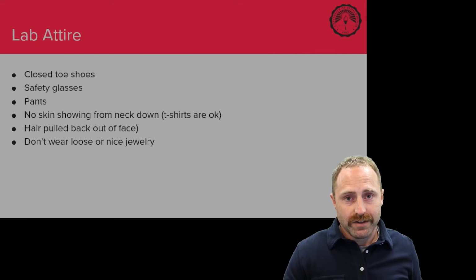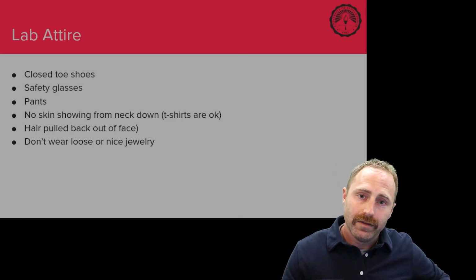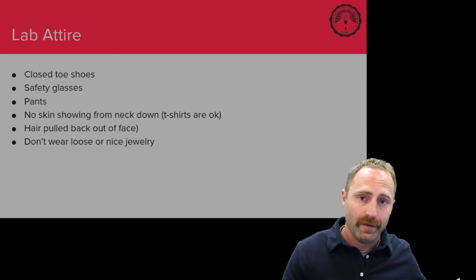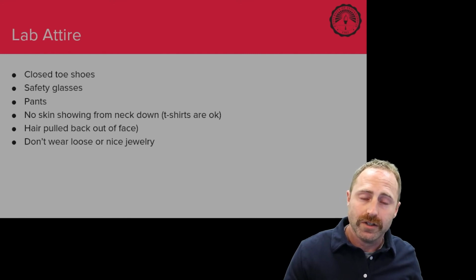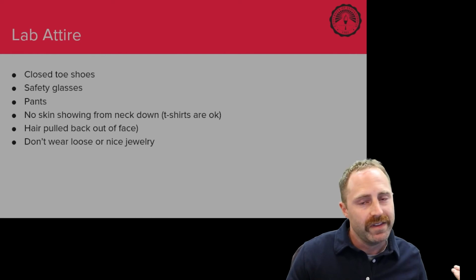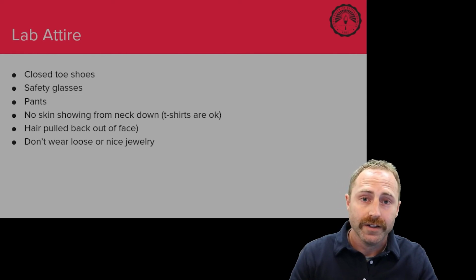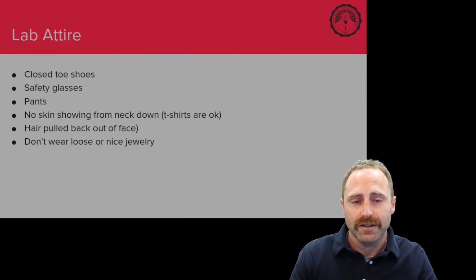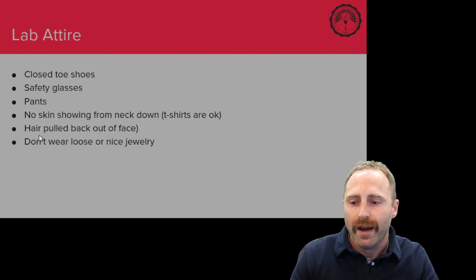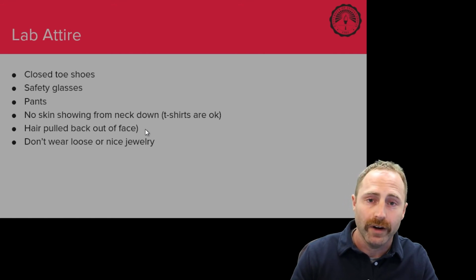If you are standing straight up and you look down and you see any skin whatsoever, be it at the top of your foot from the shoes that you're wearing because you're not wearing socks, be it because your shirt's cut short or your pants are pretty high up or you're wearing shorts, that won't fly. Make sure that all your skin is covered. That said, t-shirts are okay. That's fine. Do make sure that you have your hair pulled back out of your face.